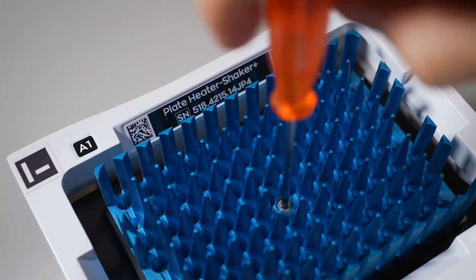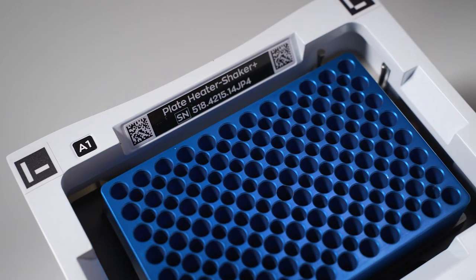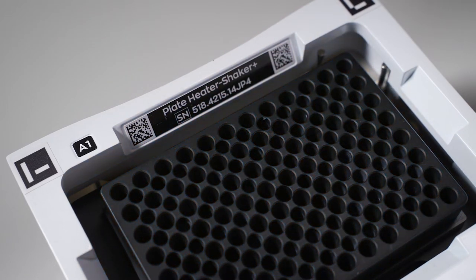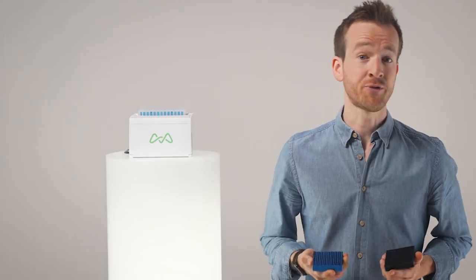The Heater Shaker Plus is a unique device designed with flexibility in mind while not compromising on efficiency. This flexibility is achieved by fitting interchangeable heat exchange adapters onto a standard base. By having specially designed adapters, we can ensure a homogenous, steady and efficient heat transfer for different consumable types, from standard conical bottom PCR plates to deep well plates.